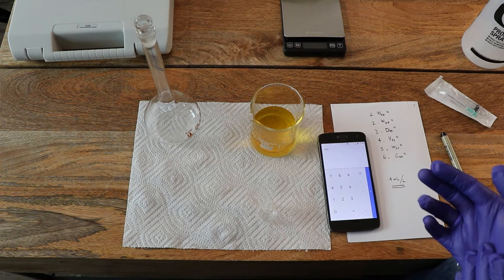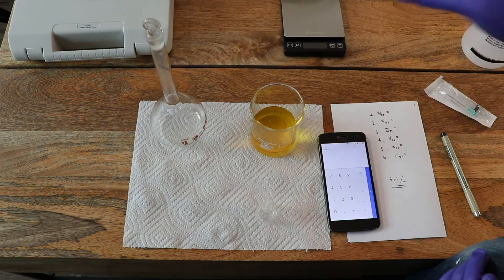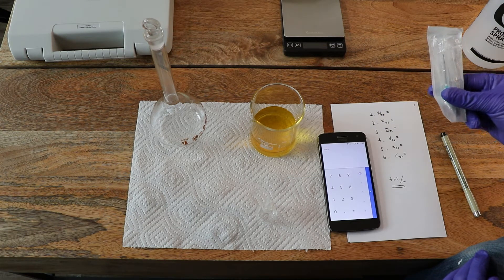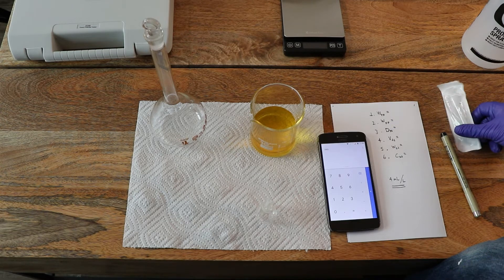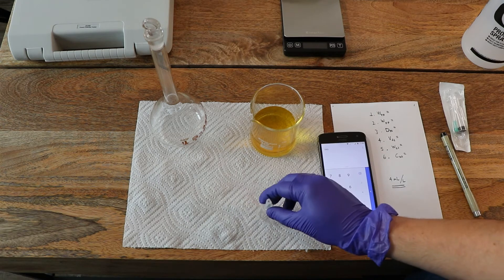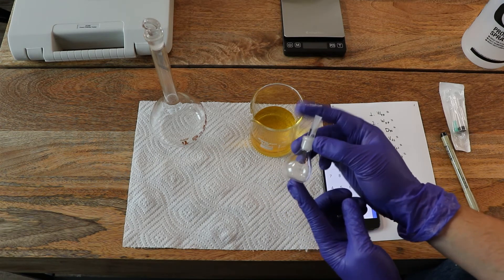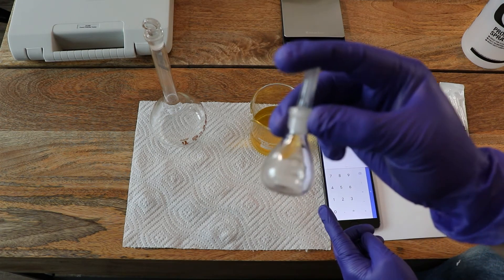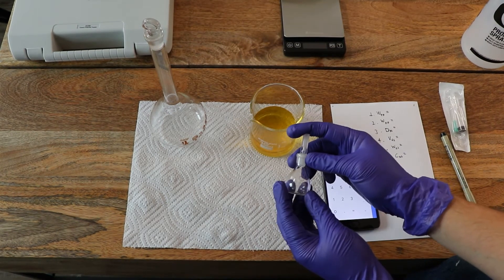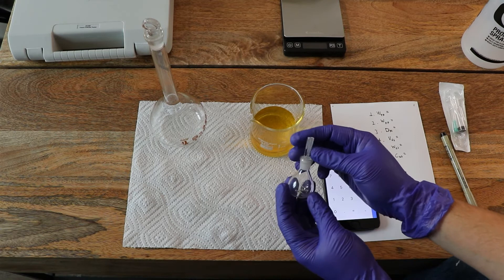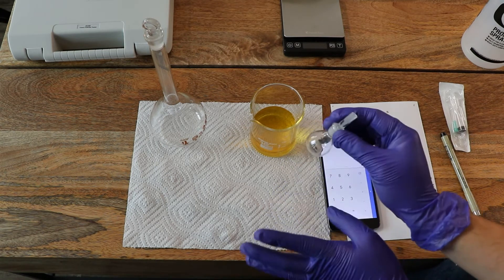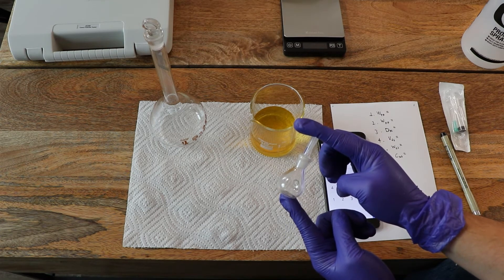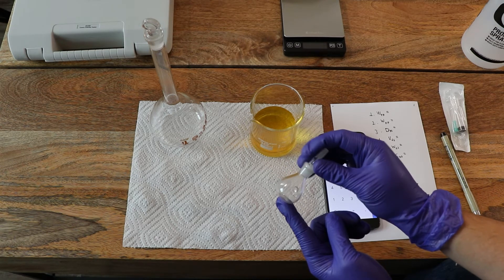Well, you could think about using something like a volumetric flask or a syringe, but these are actually not that precise or exact if we want to determine the density very well. We have a glass instrument which is actually meant for that, which is called a pycnometer. This is a 10 milliliter pycnometer. The volume of a pycnometer is fixed and it's very precise and very exact, so it's the ideal volumetric instrument to measure density, and we are going to use this.